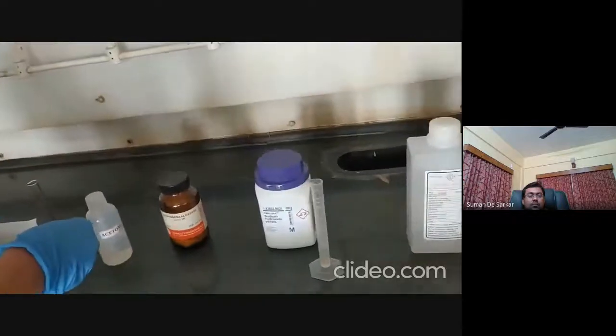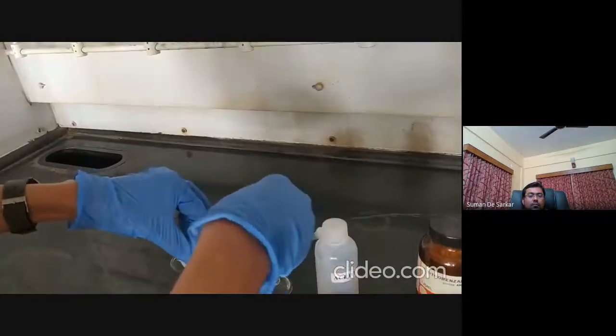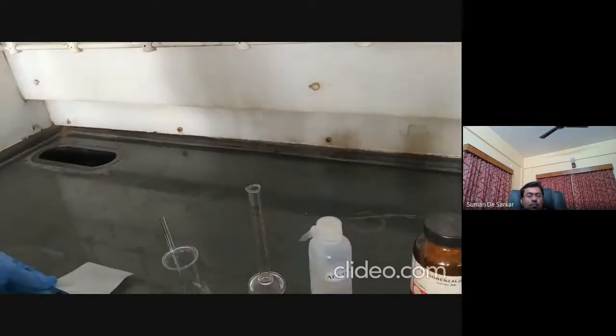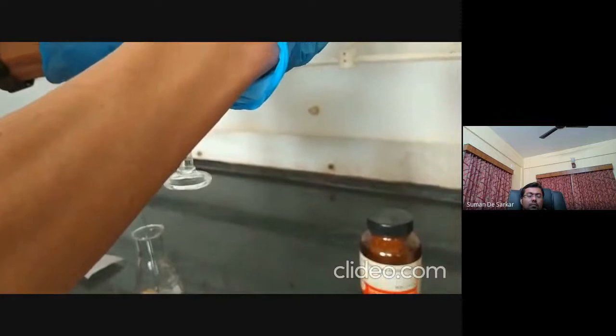So we have already weighed 2-nitrobenzaldehyde, ortho-nitrobenzaldehyde, 0.5 gram, and we have taken it inside the conical flask. Now we are adding 5 ml of acetone to this ortho-nitrobenzaldehyde.